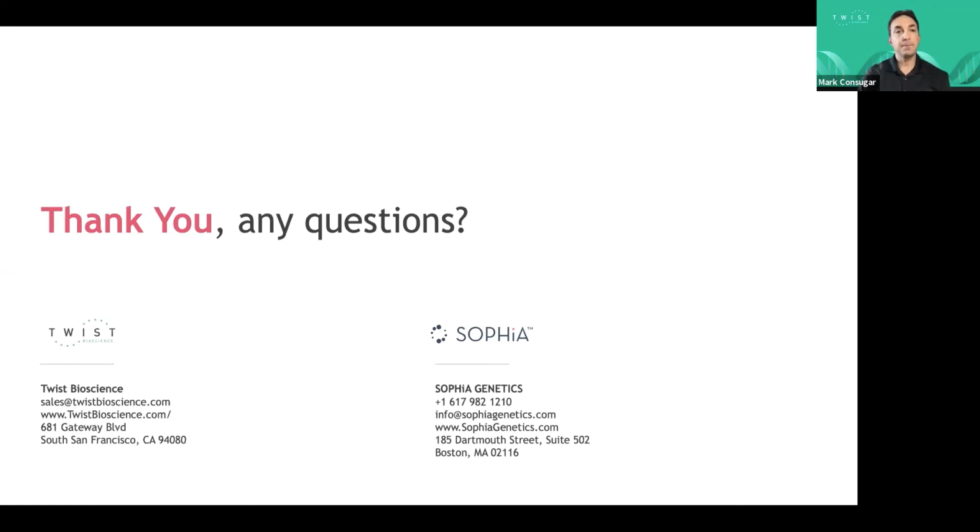Okay. Question from Veronique. What is the rate of mistakes in finding CNV for NGS of target genes? So she understands that it's possible if the coverage is not good enough, but is it possible to find a complete gene deletion or insertion in a good coverage profile that could be false? So I guess the question there being false positives, false negatives. Do you have any comments on that one, Emily?